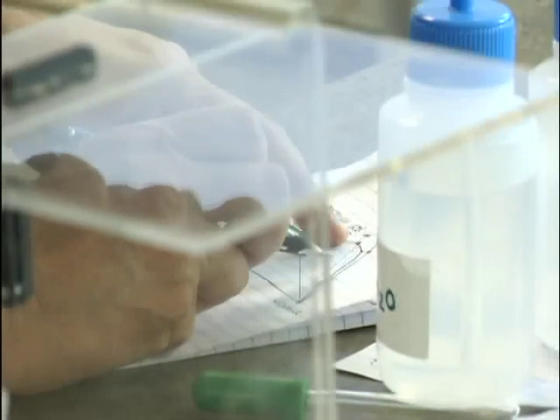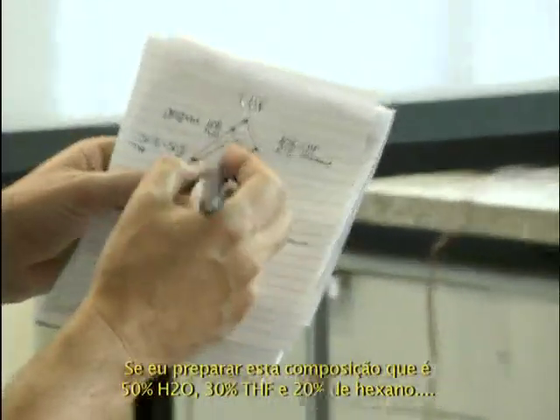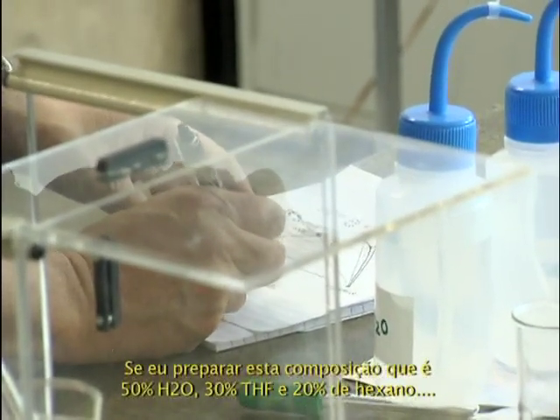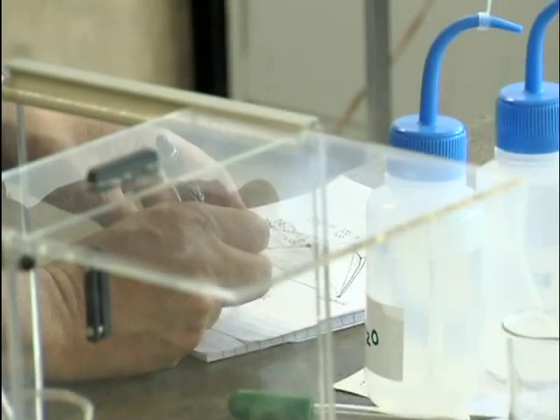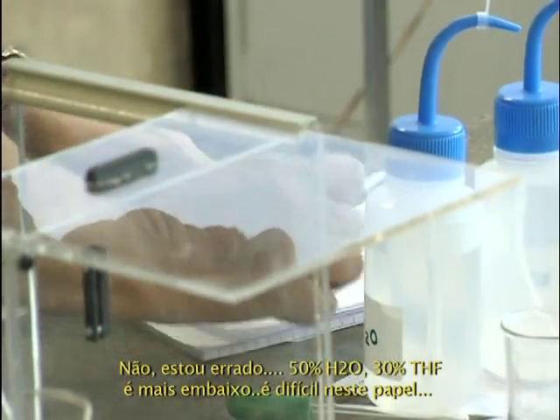1, 2, 3, 4, 5, 6, 7, 8. 1, 2, 3, 4, 5. On that line, 30% THF would be approximately here. If I prepare this composition, which is 50% water, 30% THF, 20% hexane... No, I'm wrong. 50% water, 30%, it's lower.